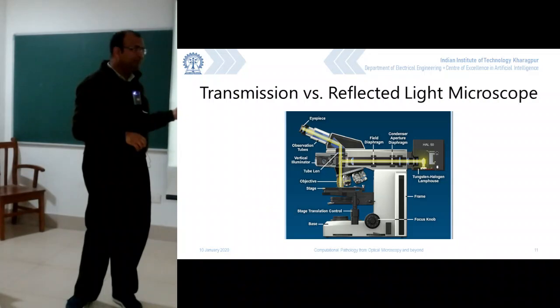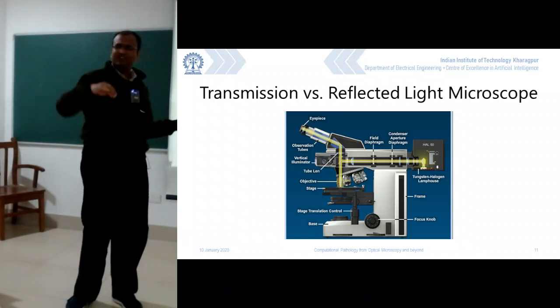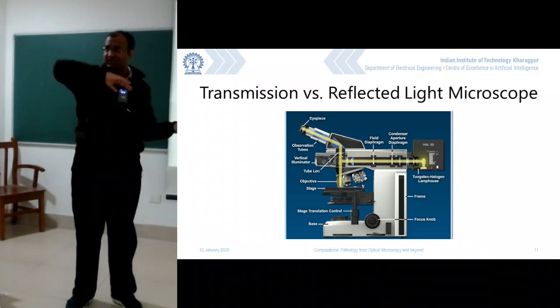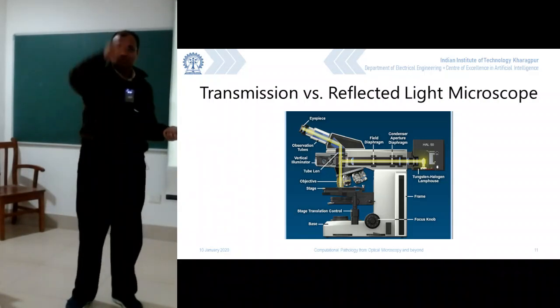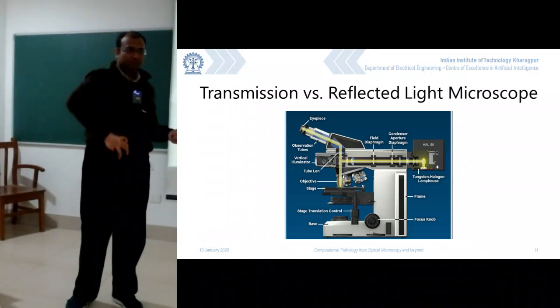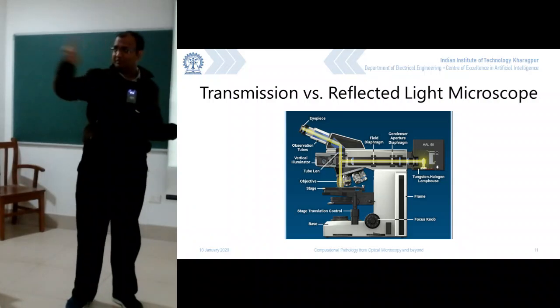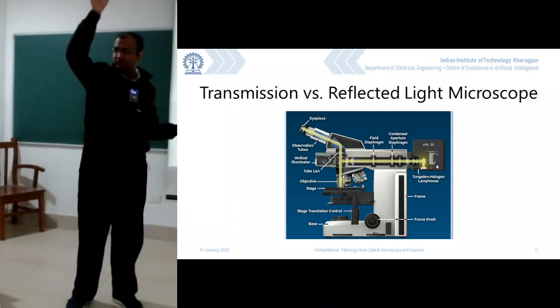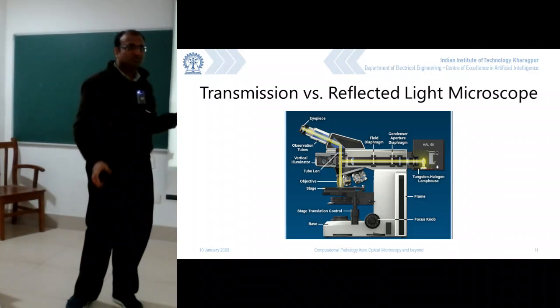There is an optical beam splitter over here such that any light coming from here will reflect only over here. It's very simple. If you have a glass at 45 degrees and a parallel stream of light coming down, it will all get reflected over here and nothing more. It will not do like this. And from here, whatever comes over there, some part of it will be reflected to the light source, and the rest is going to pass straight. Whatever is reflected to the light source, there is no sensor over here, so it's not going to burn.